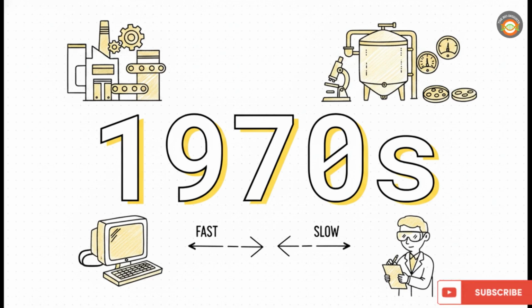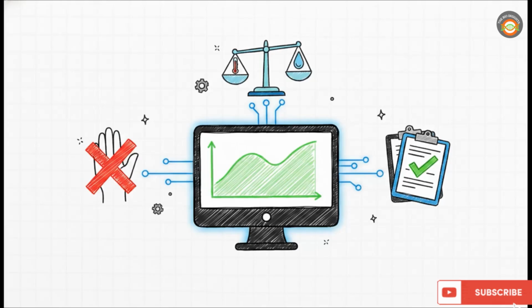Despite fermentation being a biochemical marvel, literally harnessing the power of living organisms, the fermentation industry, especially antibiotic manufacturing, actually lagged severely behind the general chemical industry when it came to adopting computers. It's true. Throughout the early 1970s, chemical plants were automating left and right, while a ton of fermentation plants were still relying heavily on manual observation and basic analog gauges. Thankfully, today, that situation is entirely different.